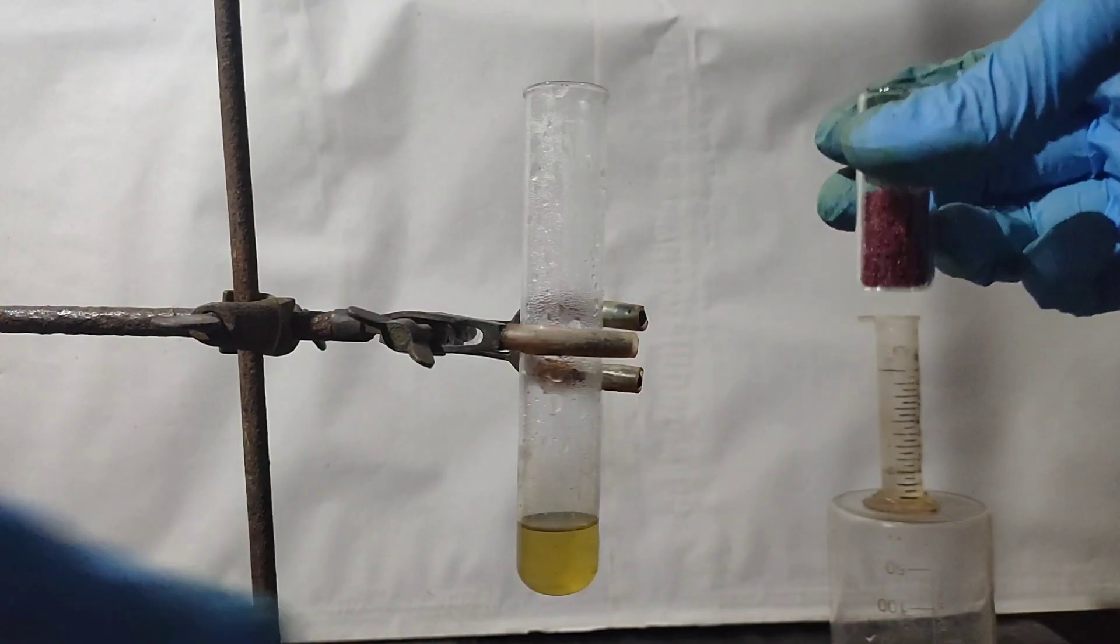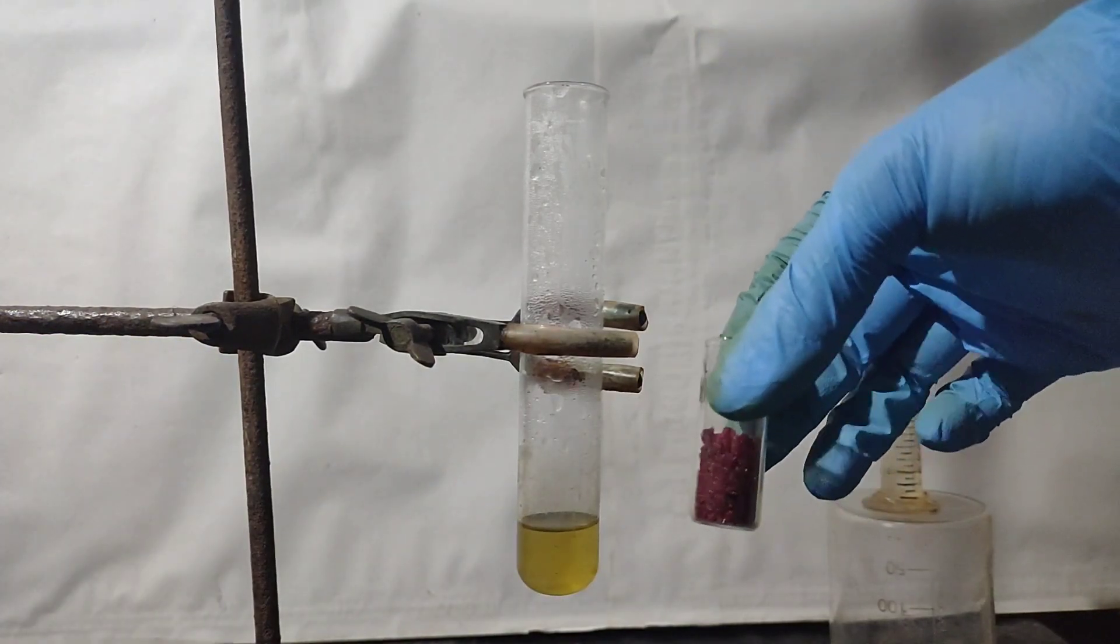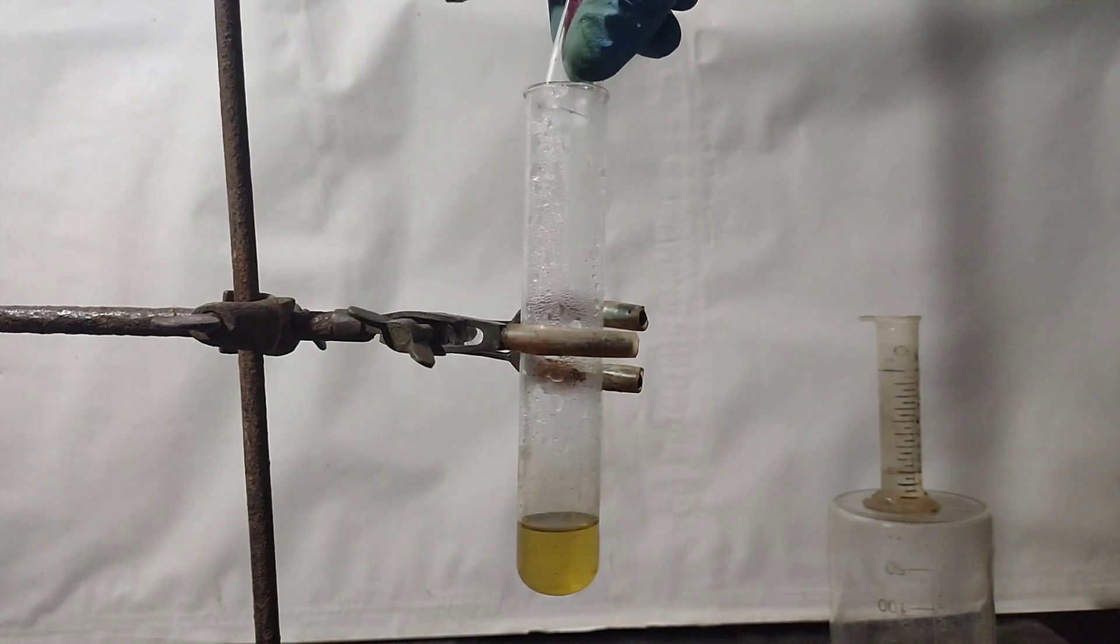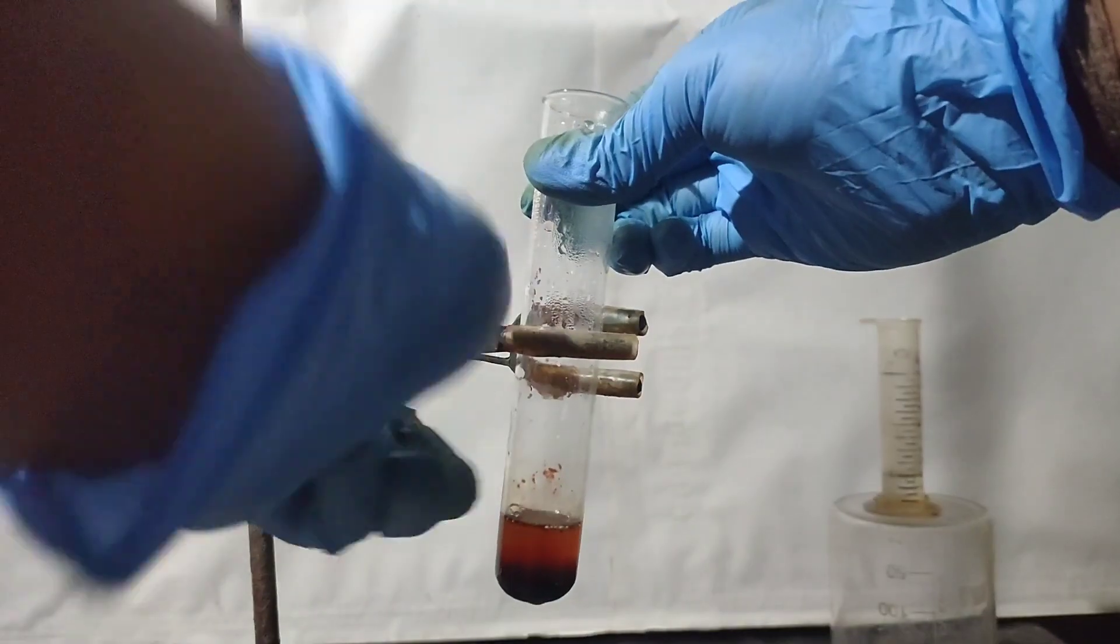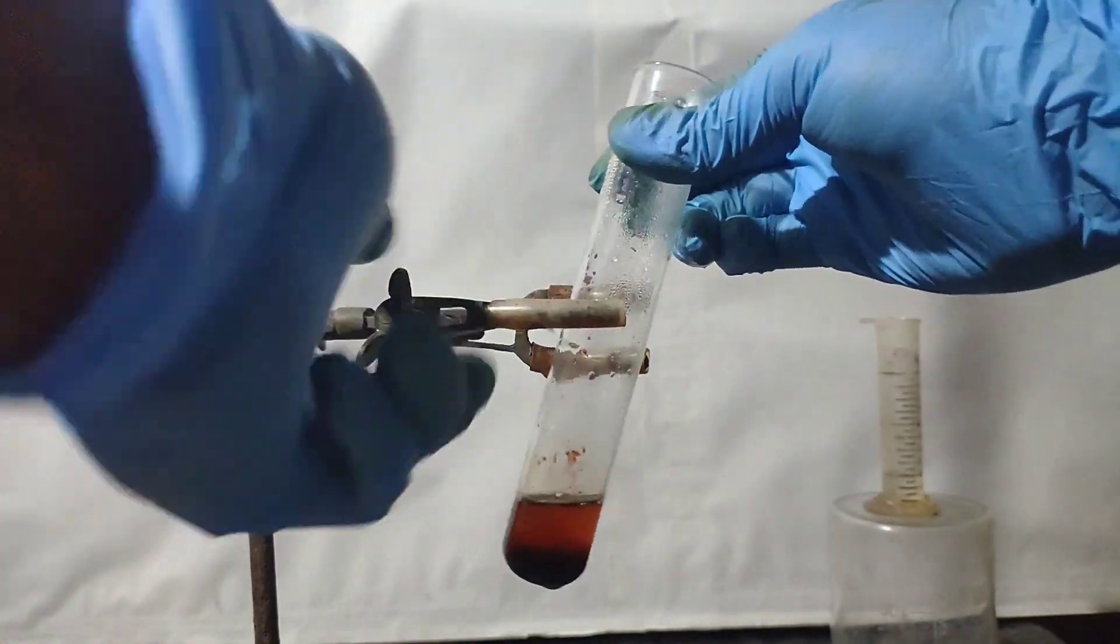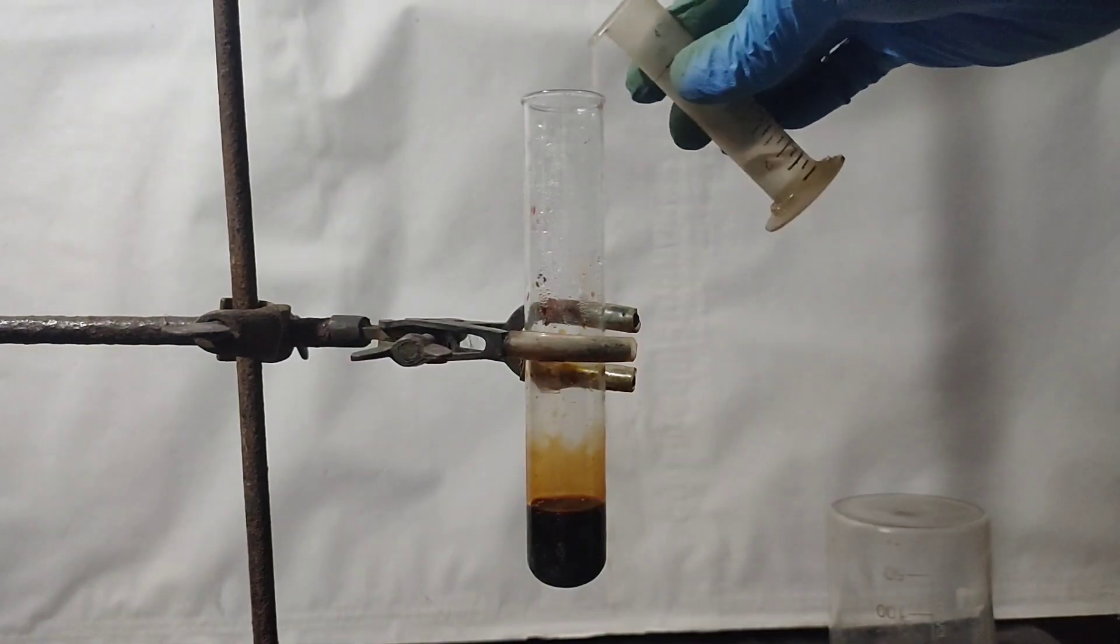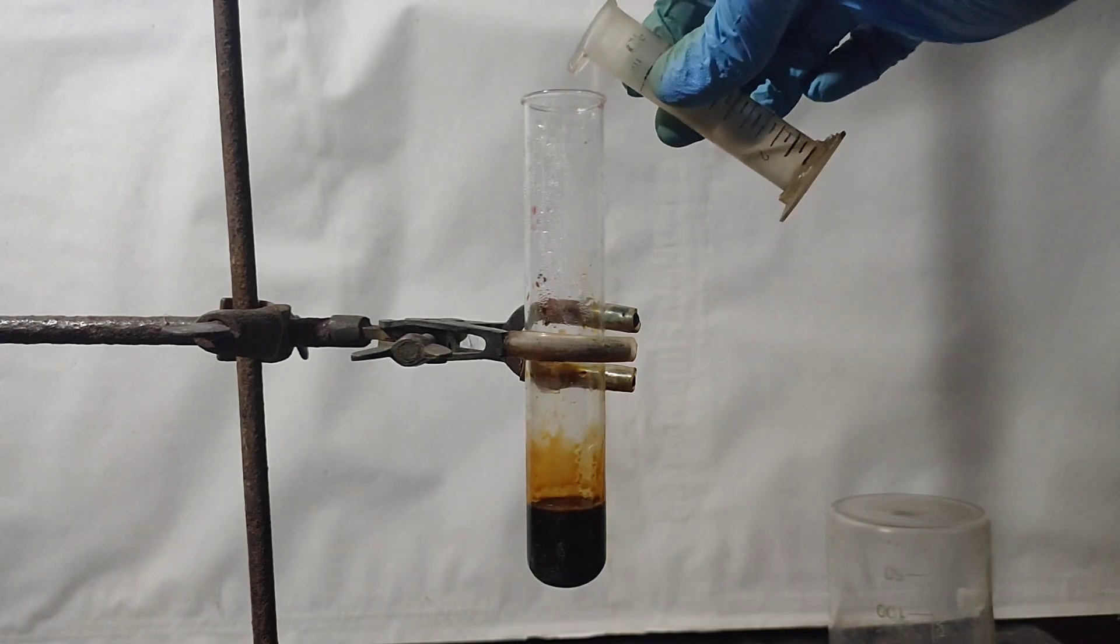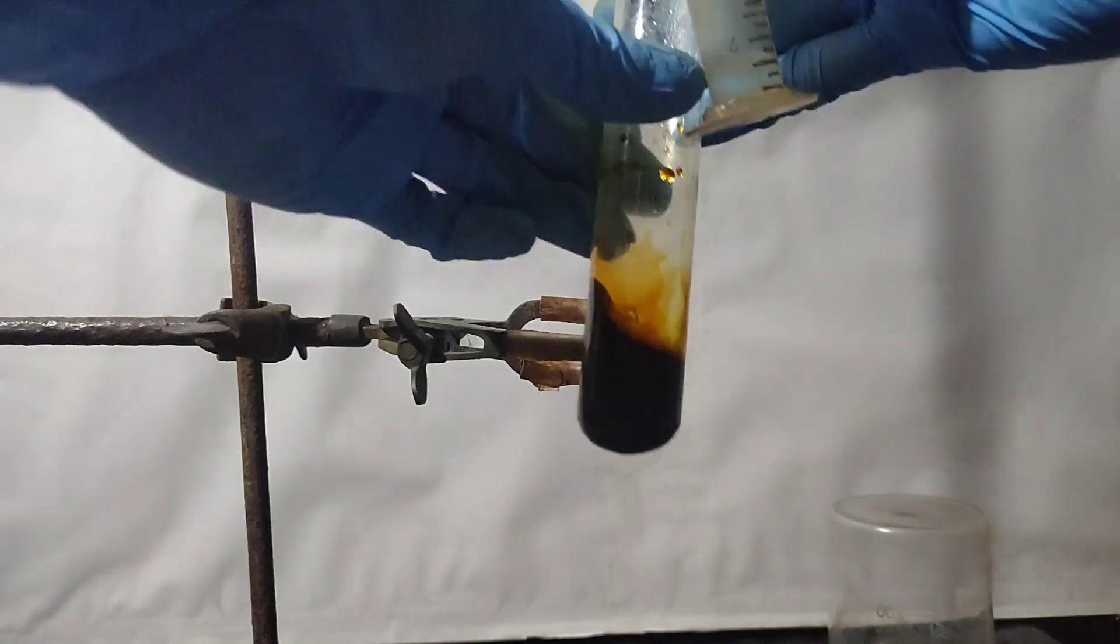When the test tube was just slightly warm, I added the cobalt chloride into it. I took out the test tube from the stand and shook it to dissolve everything. When everything dissolved, I added the glacial acetic acid water mixture slowly into the test tube with shaking.